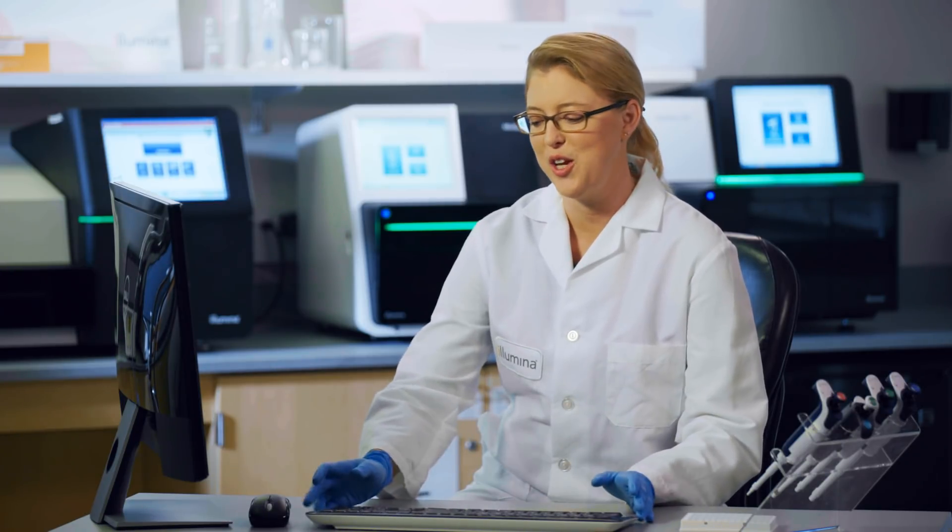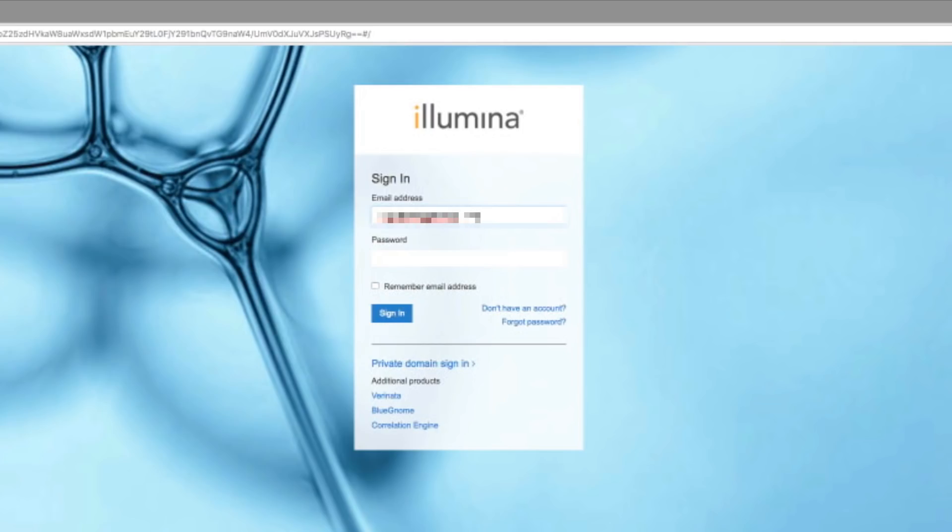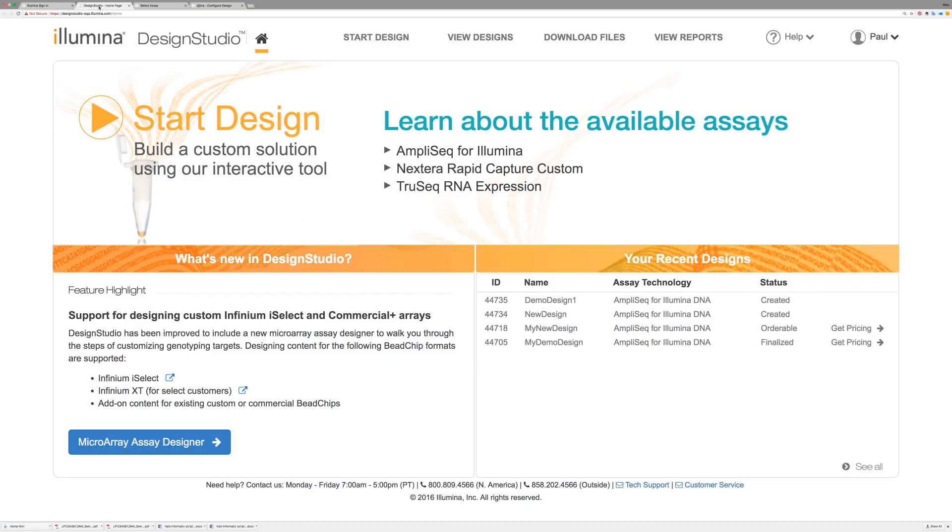For customers who prefer a more custom approach, panels can be easily designed anew or assembled from pre-existing content using our Design Studio software. To access the tool, a researcher would simply go to the Illumina website and sign in using their My Illumina account.